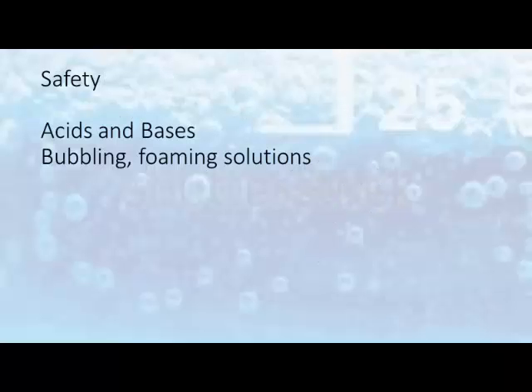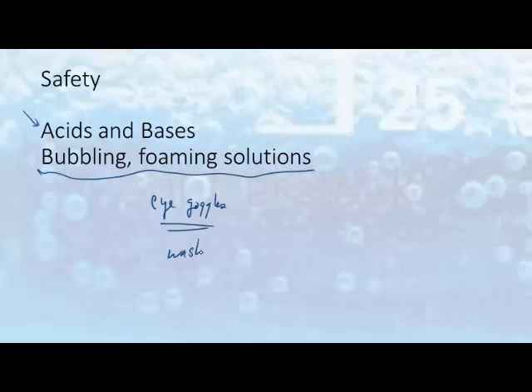Okay, finally, safety for this lab. The biggest issue with this, of course, as in many labs, is getting things in your eyes. And for the most part, things in this lab are not terribly toxic and not particularly corrosive, because they're used in Alka-Seltzer, but we're using different concentrations and you don't know how bad that will be. So there are acids and bases and you should treat them as such. And the biggest problem here is actually that things are bubbling and foaming, and as such can spit out and get things on your skin or in your eyes. So always wear eye goggles and always wash when you get anything on your skin whatsoever. And that's the end of this pre-lab.